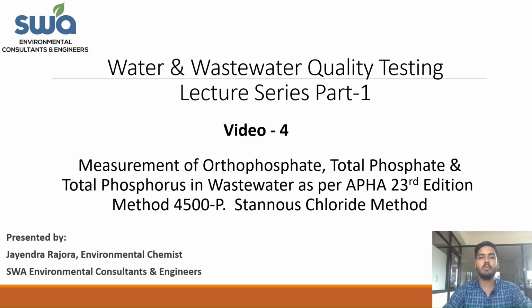This is video number 4 of the Water and Wastewater Quality Testing Lecture Series Part 1. In this video, we are going to learn about the analysis of orthophosphate, total phosphate and total phosphorus in wastewater as per APHA 23rd edition method 4500P, which is the stannous chloride method. So let's start the video.